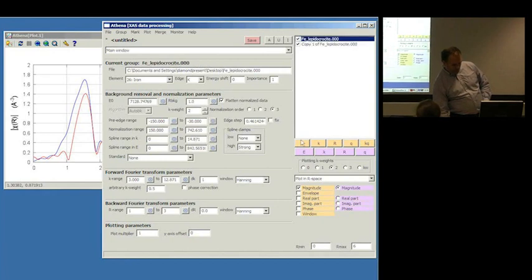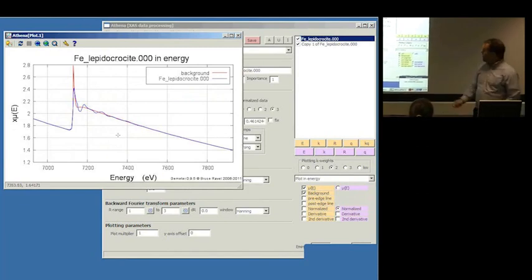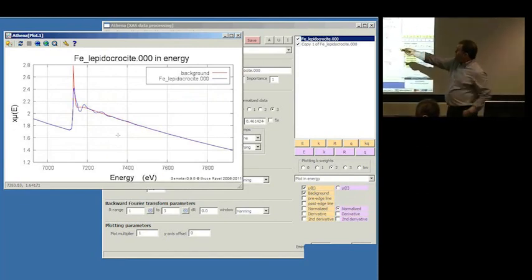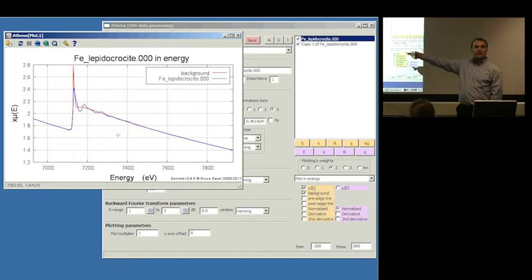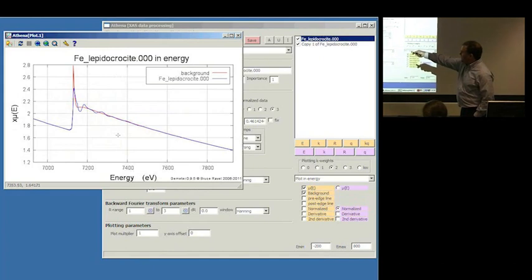So I'm going to go back to the, not the copy, but the good one. So up here, close to the edge, the wiggles are really, really big. It's really easy to see that there are oscillations in the data. Out here on this scale, well, okay, here you can still sort of see that there are oscillations. Out here, they're starting to get to be really small. But the amazing thing about all of this is that our beamlines these days are good enough and stable enough and with enough flux that there's actually signal out here in the flat part that's reproducible.